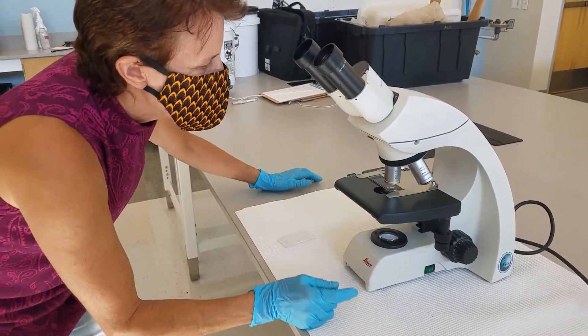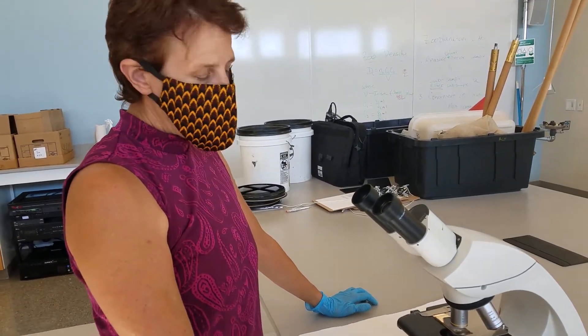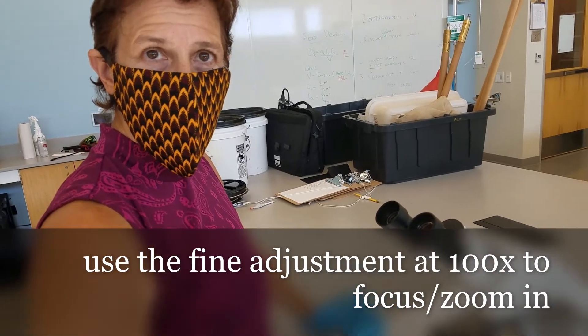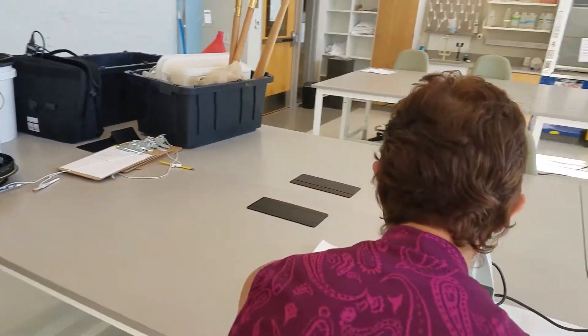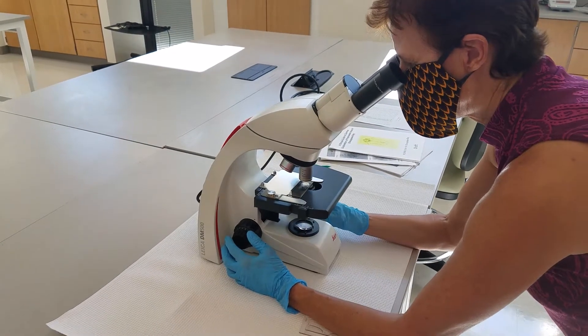Make sure it goes into place, and then we're going to use the fine adjustment to focus in, zoom in, and get some focus on organisms up a little bit closer. Hopefully you'll be able to see them a little bit better.